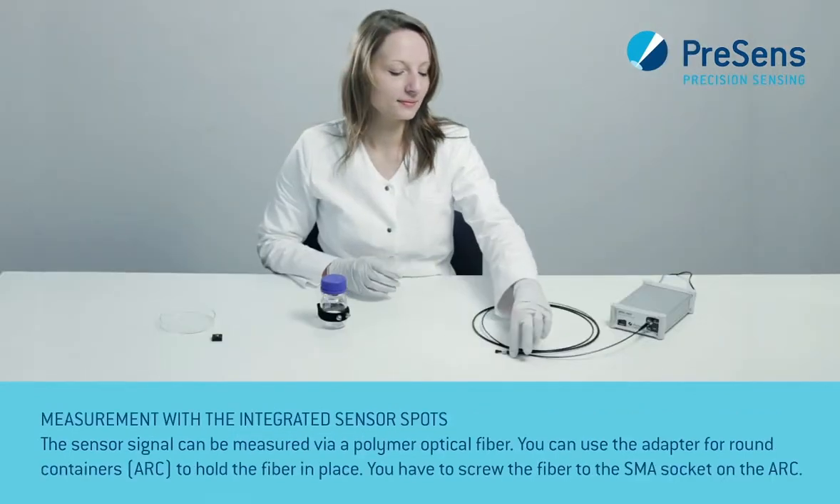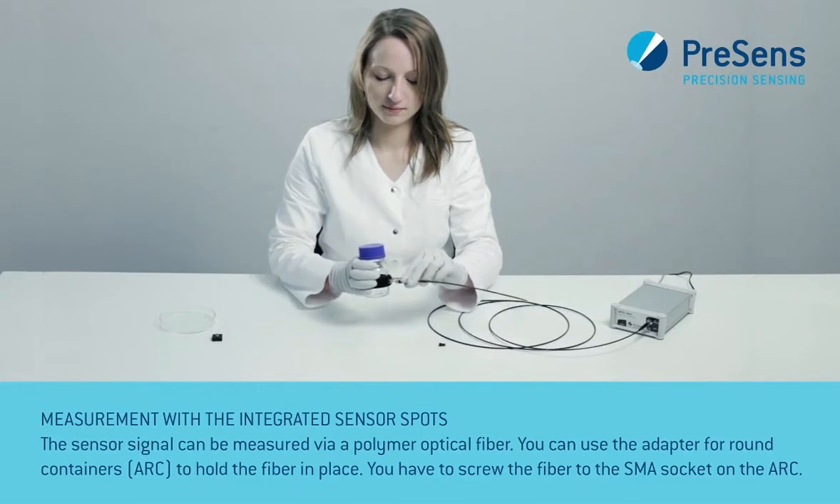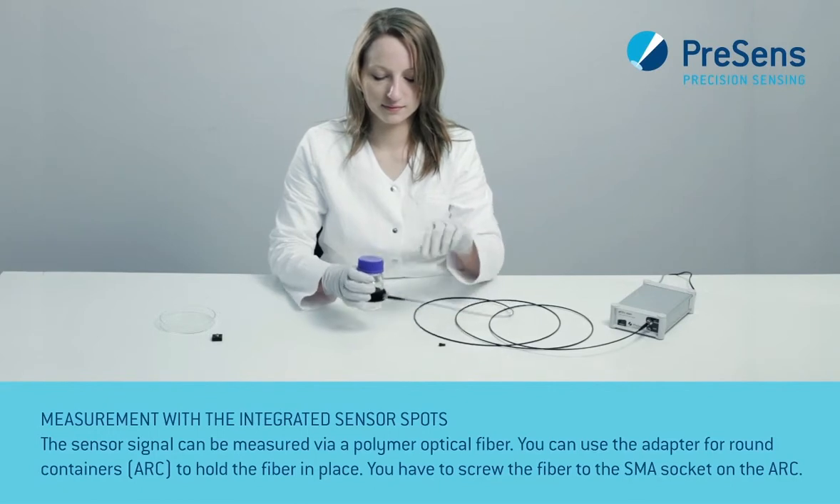The sensor signal can be measured via polymer optical fiber. You can use the adapter for round containers to hold the fiber in place. You have to screw the fiber to the SMA socket on the ARC. For measurements you can also use the stick-on adapter SOA.